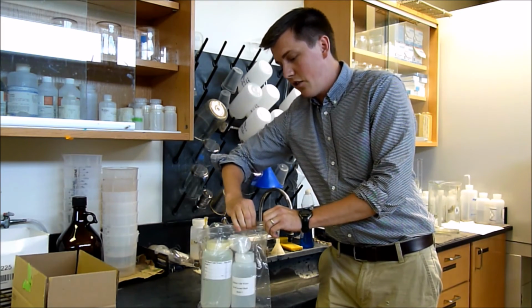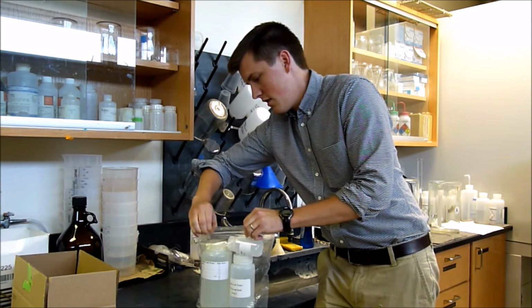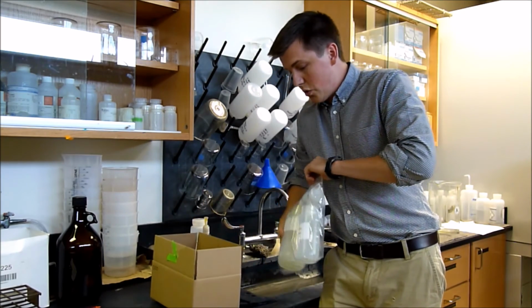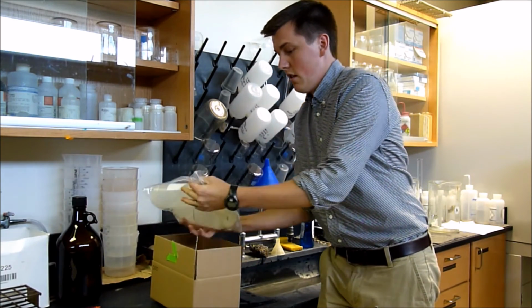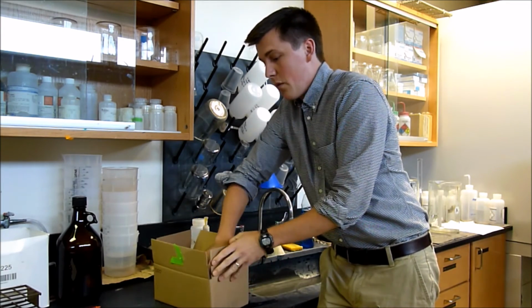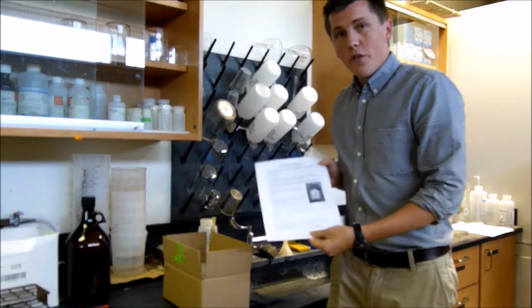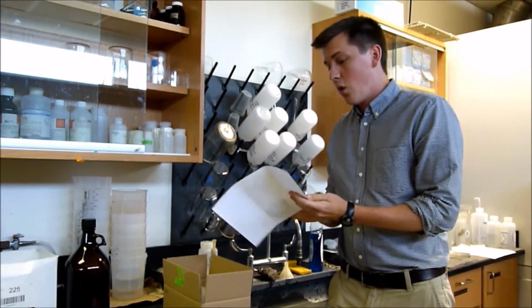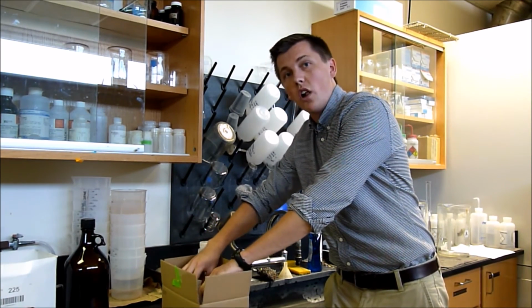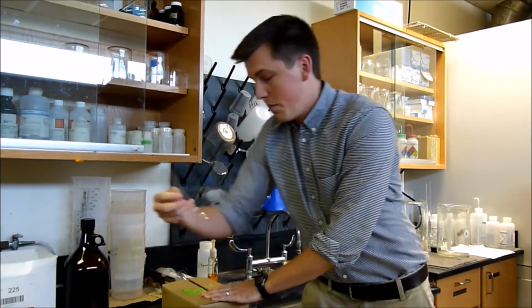You can then seal the bag, and place the entire thing into the box that they came in. And we want to make sure that we use the same box with the same label that they came in. Then, don't forget to place your information sheet and instruction sheet back into the box with all of your information on it. And then you can go ahead and close the box and reseal it with a piece of tape.